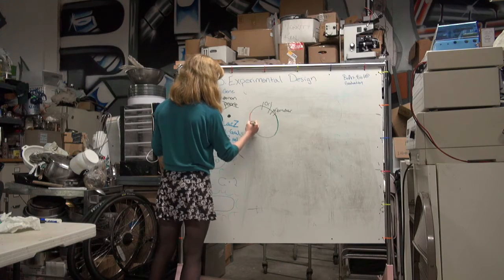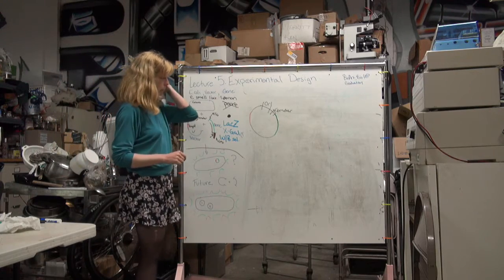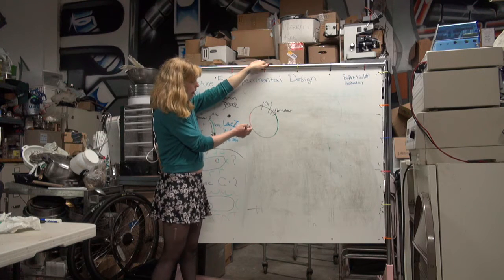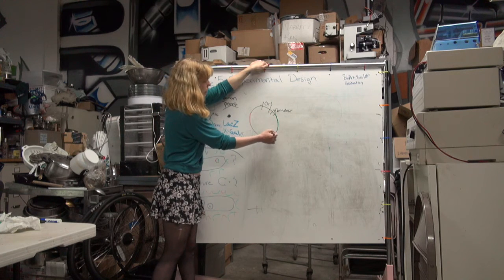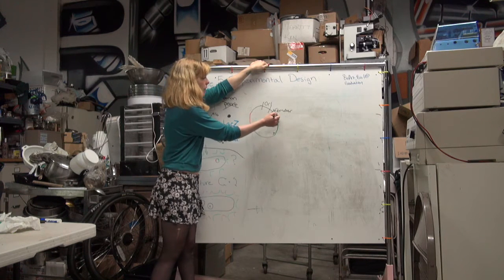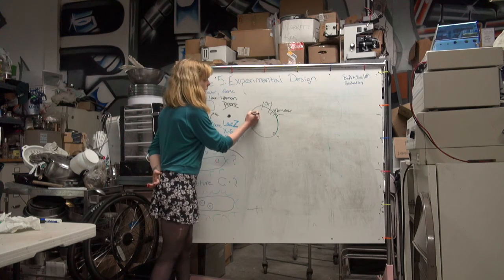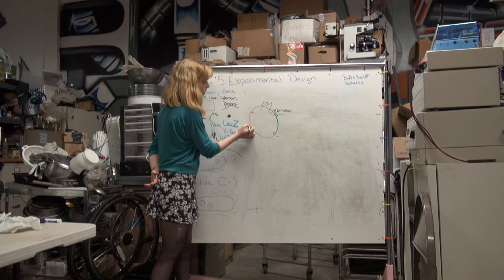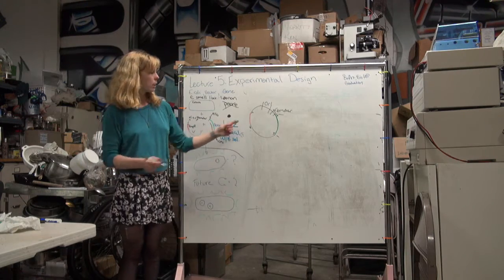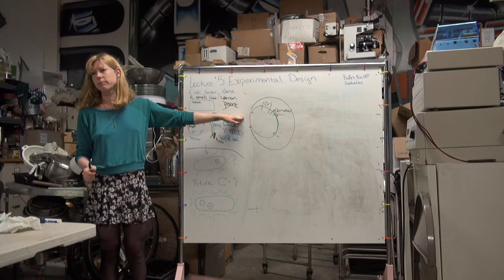For PCR, you design primers, and based on the directionality of the primers, if you just want to clone out this gene, you make primers like this for the top and bottom strand, and you would only get this piece out. If you flip that around, so the primers go out and away from the area that you don't want, you would only get this product and not this piece.